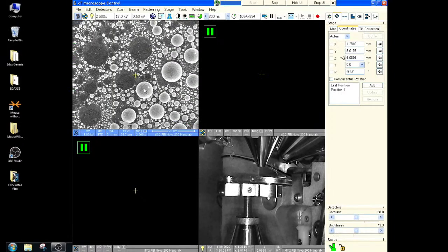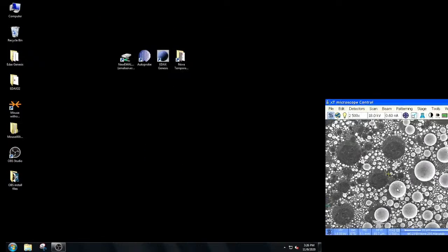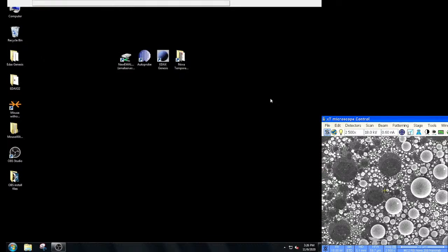Okay, so let me turn on the filter again. Filter, crop it back, close. Okay, so hopefully we're back to where we were. So let's go over and we'll restart Genesis. And hopefully this time we won't get a fail to connect. Otherwise, we could be in trouble for today's session.